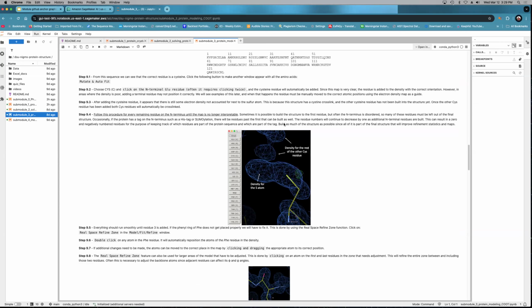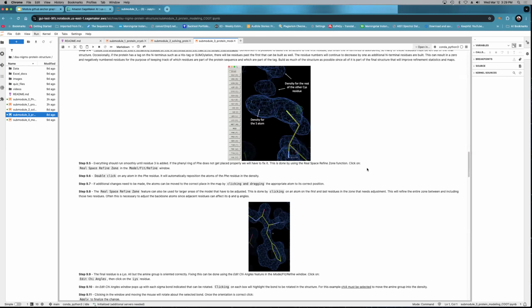The protein we're looking at here is lysozyme, a very famous protein that's very easy to crystallize. And there's over 1,000 data sets in the Protein Data Bank on it. This one just happens to be really high resolution. There's a little cysteine cross-link that's here, so you can see what that looks like while building.